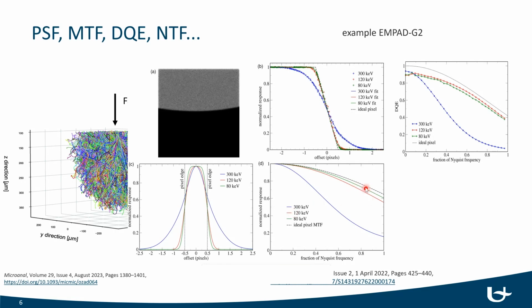And again, you see the effect at 300 kV that there's a lot more suppression of the high frequencies. So to your image, it will look a bit like a blurring effect or a low pass filter that is happening there. But as I said, this is not the end of the story. You can actually, with declustering, you might be able to push this line all the way up again, depending.